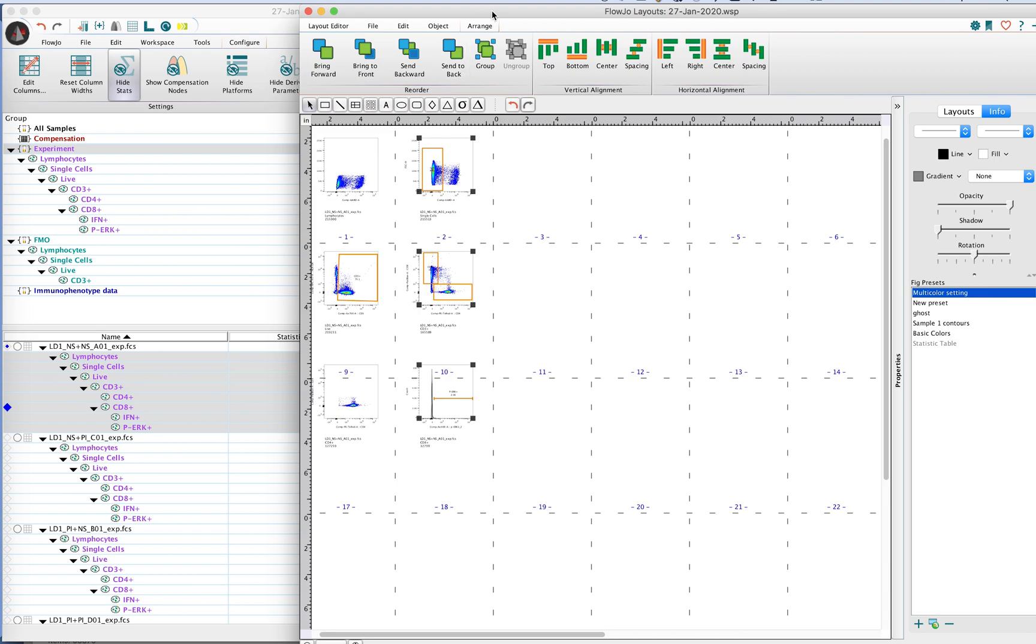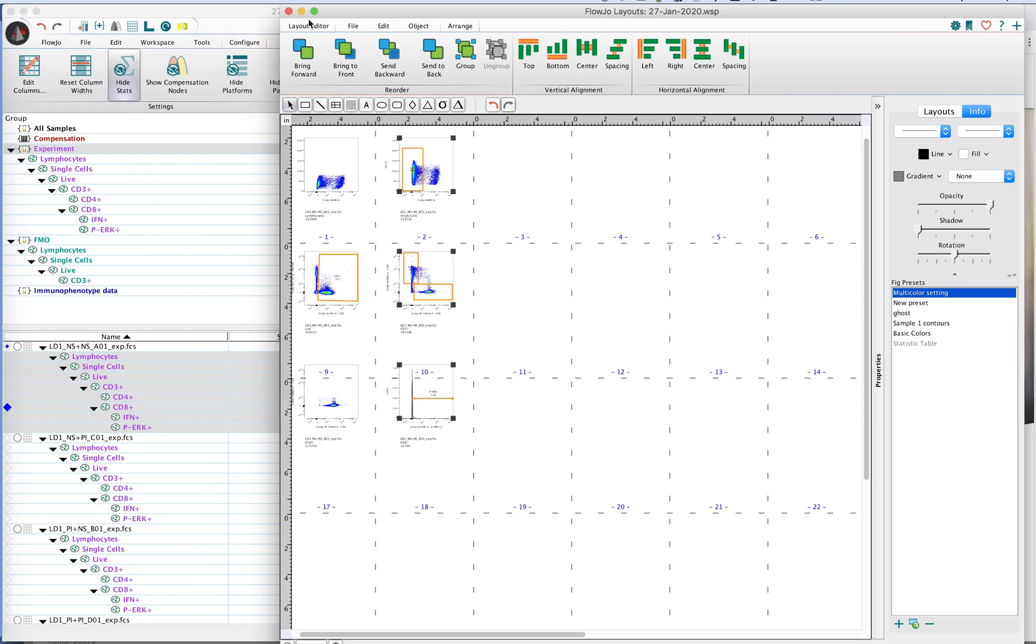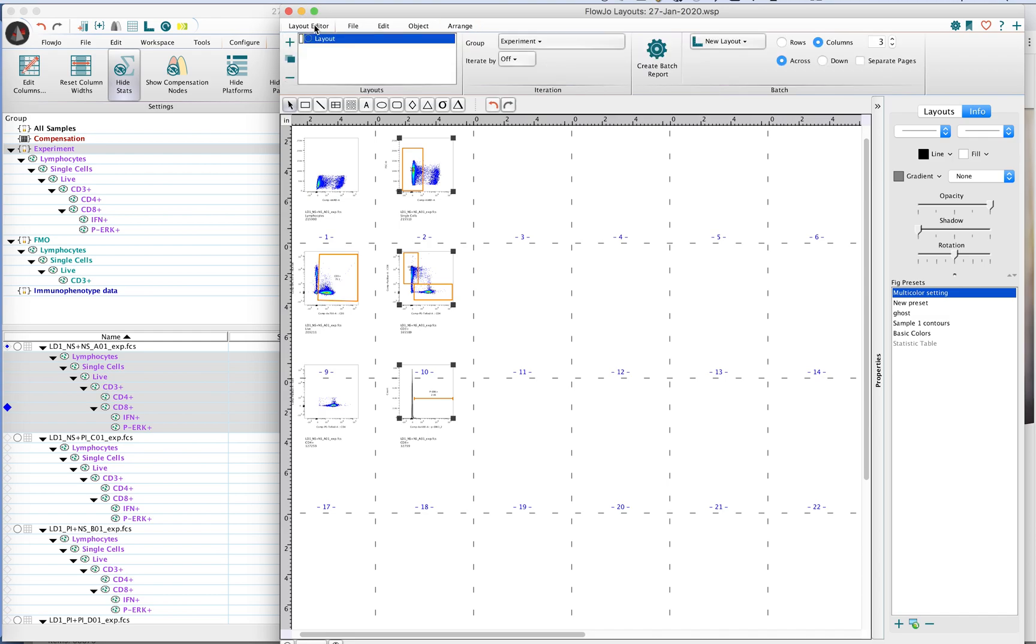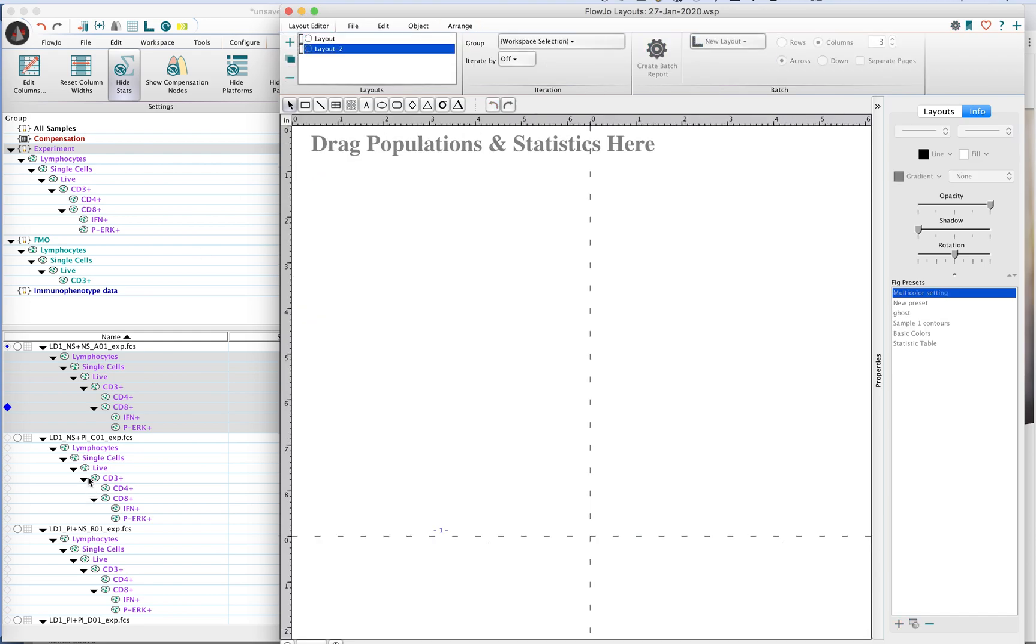There is another tool that you can use to help you quickly group or align your plots. If you don't like to use the alignment tools here underneath the Arrange tab, we go back to the layout editor. I'll just create another layout and keep those populations in the workspace selected.